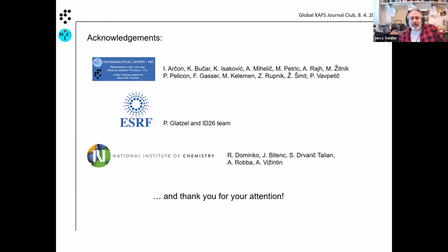I think if you have a small source, like at the synchrotron with focus, then Johann and Johansson are going to be pretty similar. But if you're in the lab with a large source, then we have to mask the Johann quite a bit when we get away from backscatter. And we've been working with an optics company to see if they can make a small radius Johansson, which is of course very challenging.